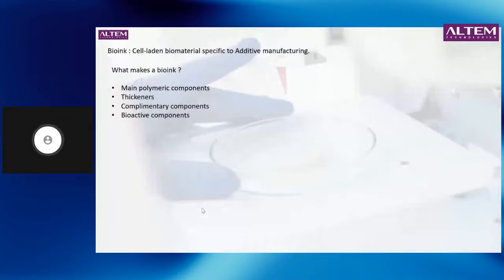Then you have complementary components. Complementary components would be buffers. You would have maybe cross-linking agents, which will allow solidification of the material. You will allow use of materials that can allow better cell attachment, say maybe RGD structures, or you will have buffers. You require something that can be a thinner as well to the solution. You want something as a stabilizing agent. All of these are complementary components.